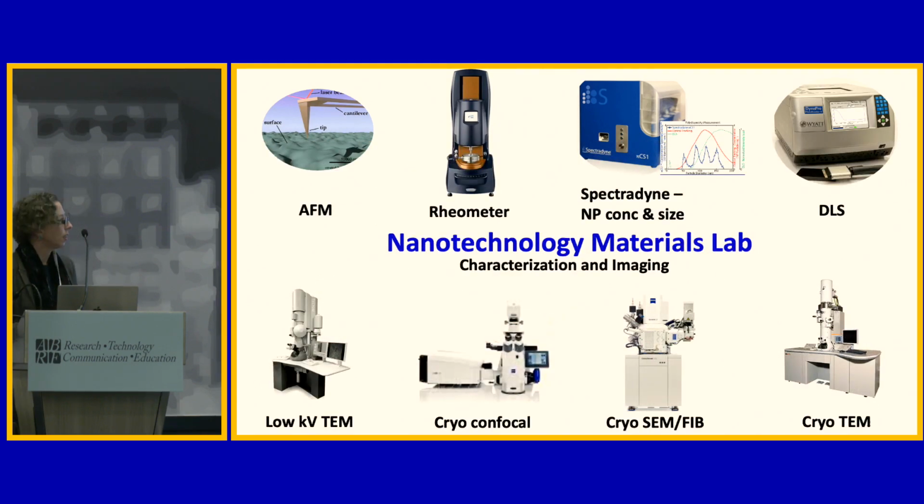So these are instruments that I would say are relatively accessible. I can train your community in either just a single session or several sessions over the course of a week, and then people can be relatively independent and they can work on their own terms.